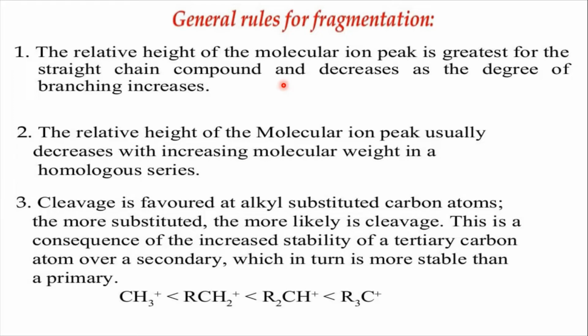The molecular ion of a branched chain alkane is converted to a stable carbocation very fast. Therefore, the molecular ion in a branched chain alkane is less stable, and depending upon its stability, the intensity of the molecular ion is less as compared to a straight chain alkane.